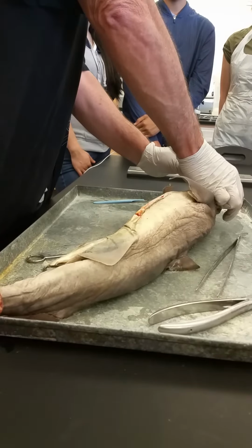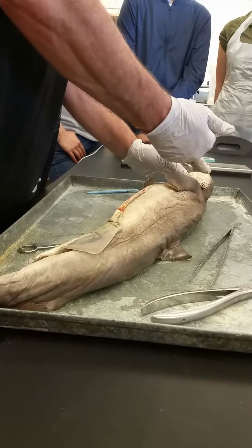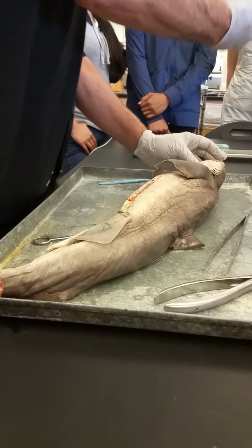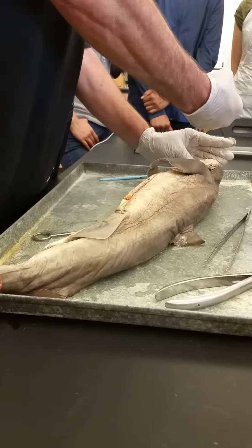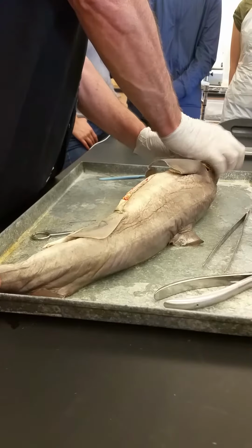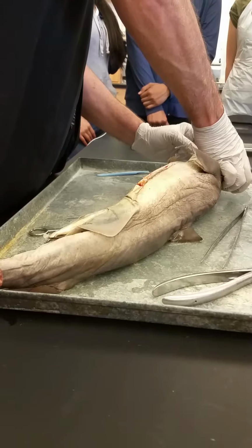If you had something like a ray that's eating shellfish, it would have big flat plates for crushing shells. If you had something like a tiger shark or a white shark that takes bites out of things, more triangular teeth with serrated edges for cutting tough meat. So again, you can often tell a lot about what an animal eats by looking at its teeth.